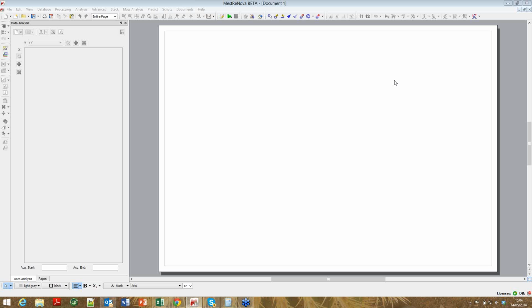So it's going to be a little bit random today. I'm just going to pick on little subjects and show you some data which are sometimes good for displaying certain bits of the functionality in the software. Hopefully you'll enjoy it, get something out of it, and it'll be time well spent for you. So let's crack on then.